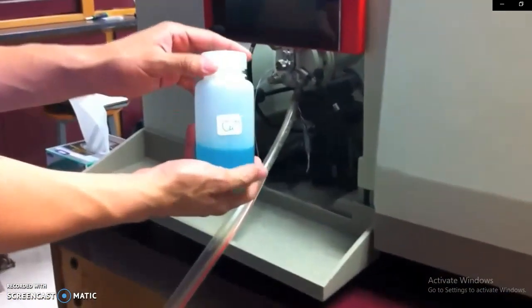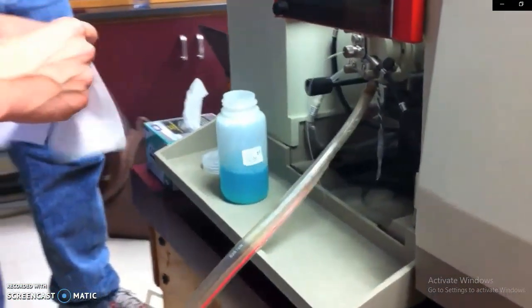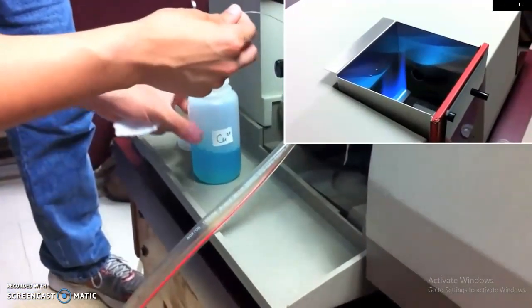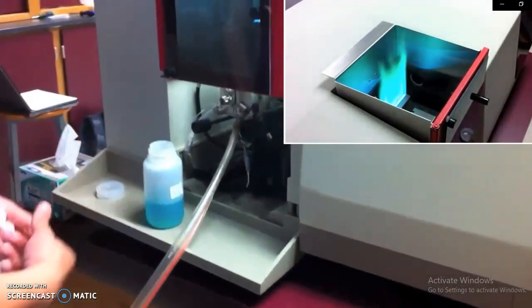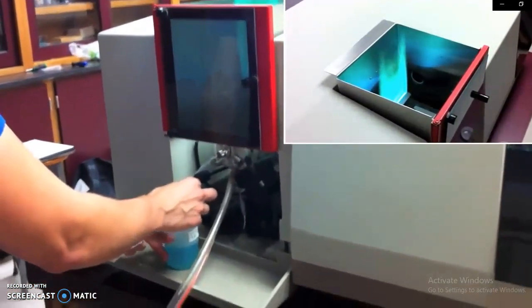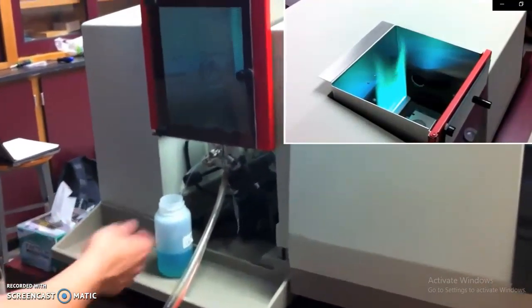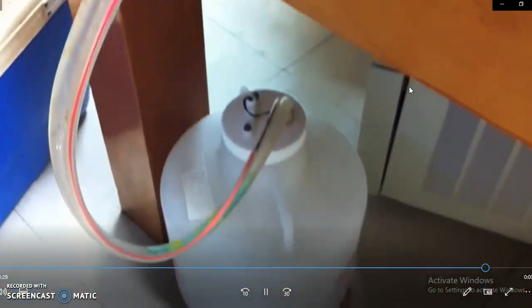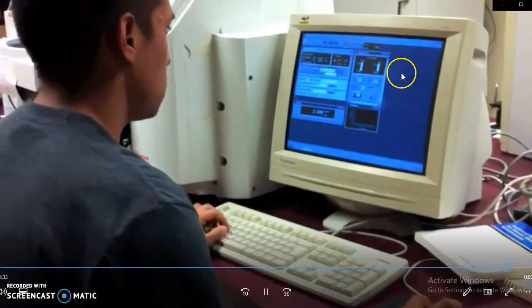This demonstration will use a sample of copper. First, start by cleaning the sample capillary with a chem wipe. Then, insert it back into the sample to be aerosolized, mixed with gases, and released into the flame. The flame turns a green color that is distinctive of copper. Look at the color of the flame, The color is dedicated for, it is actually very specific for each element. The data is then sent to the computer.